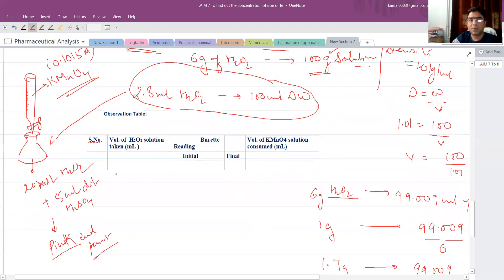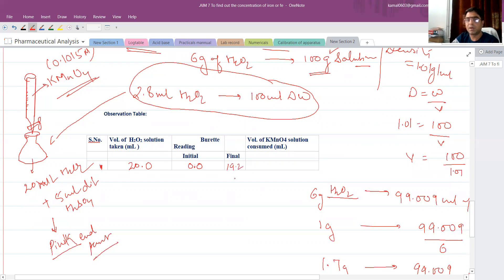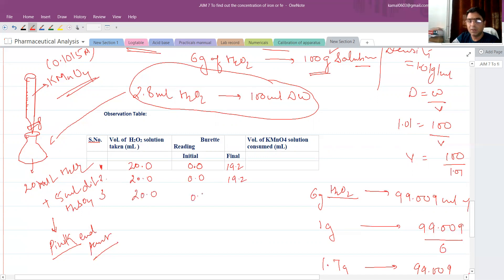Note the endpoint in the observation table. Volume of H2O2 taken is 20 ml. Initial burette reading is 0 ml. Suppose the final reading is 19.2 ml; the difference (volume of KMnO4 consumed) is 19.2 ml. Repeat the titration to confirm concordant readings. If consistent at 19.2 ml, that is our endpoint.